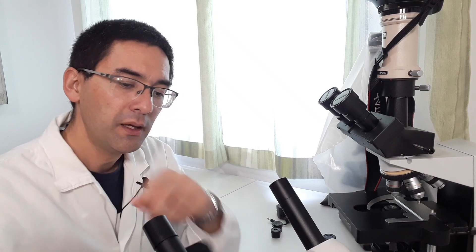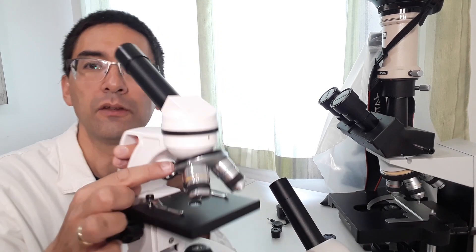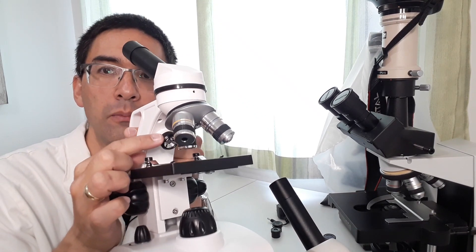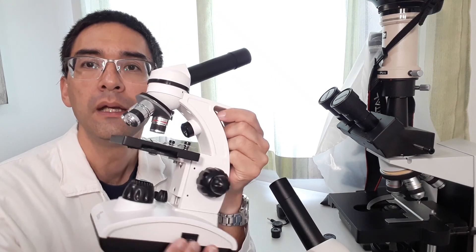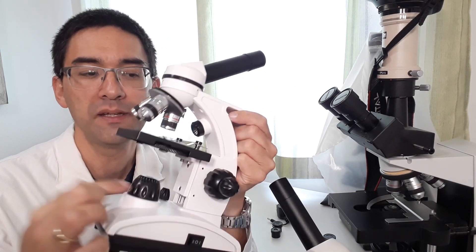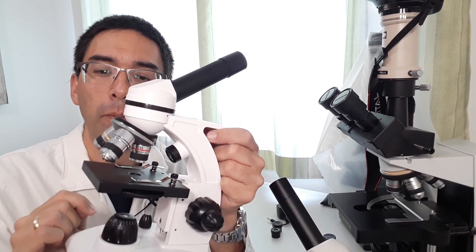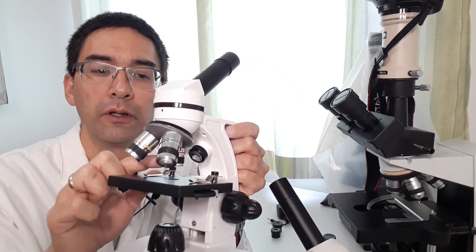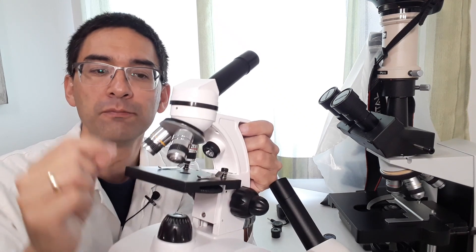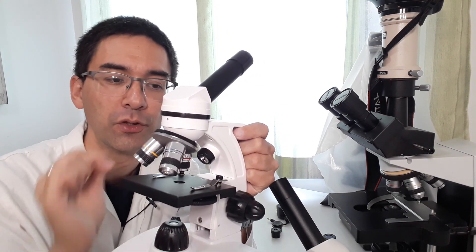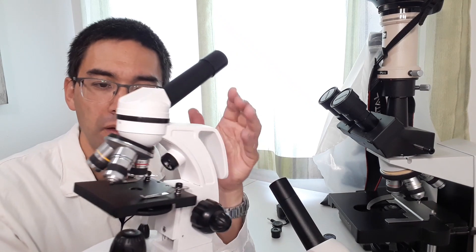First of all, this Telmu microscope also has a top illumination. So there is also a lamp from the top and you can basically decide which one you want to use. However, the lamp from the top is only really meaningful for the low and medium power objective because the high power objective casts a shadow and therefore you cannot use it. Not a big deal.